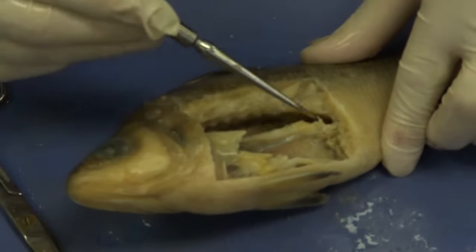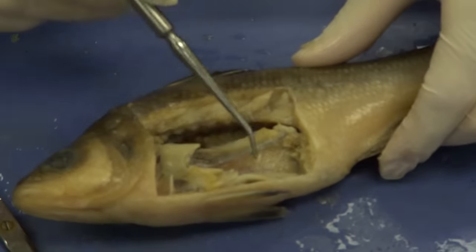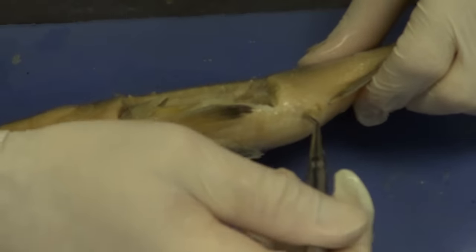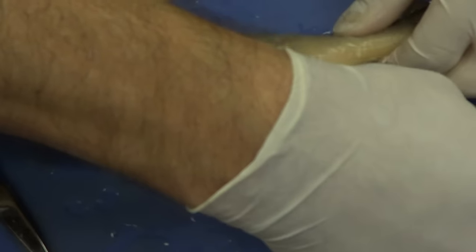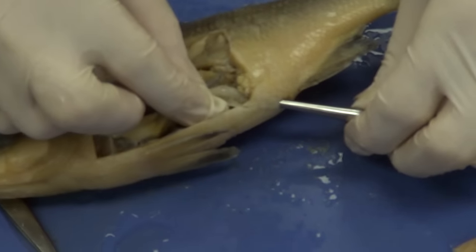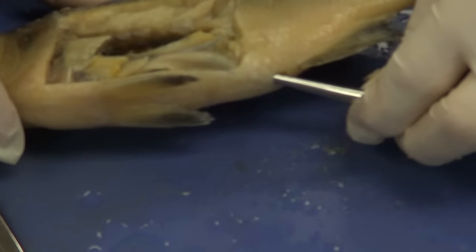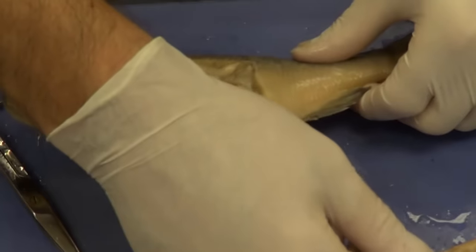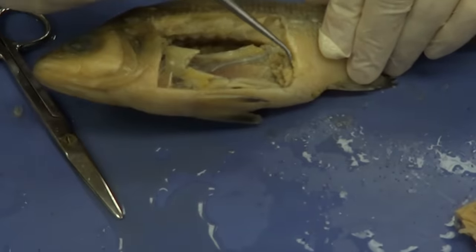If we follow the kidney down, we're actually going to get to a small bladder. To confirm the intestine, I'm going to put the probe into the anus just a little bit — you can feel that the probe is inside the intestine. That's how you find your way around; sometimes you have to go into these spaces and see where they lead. The other space, going in there, leads up into the bladder.